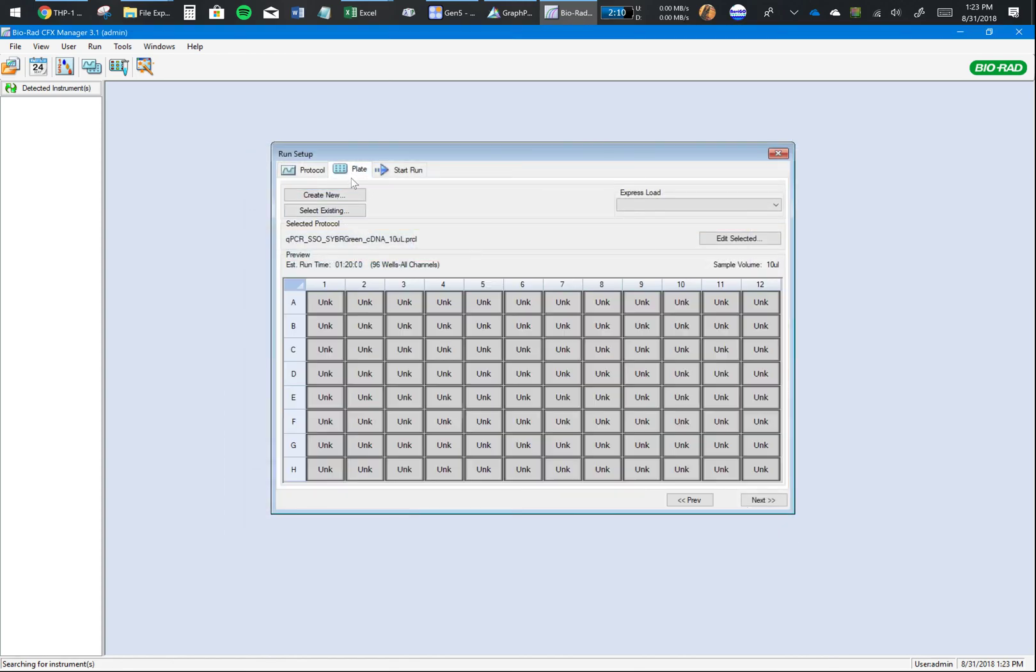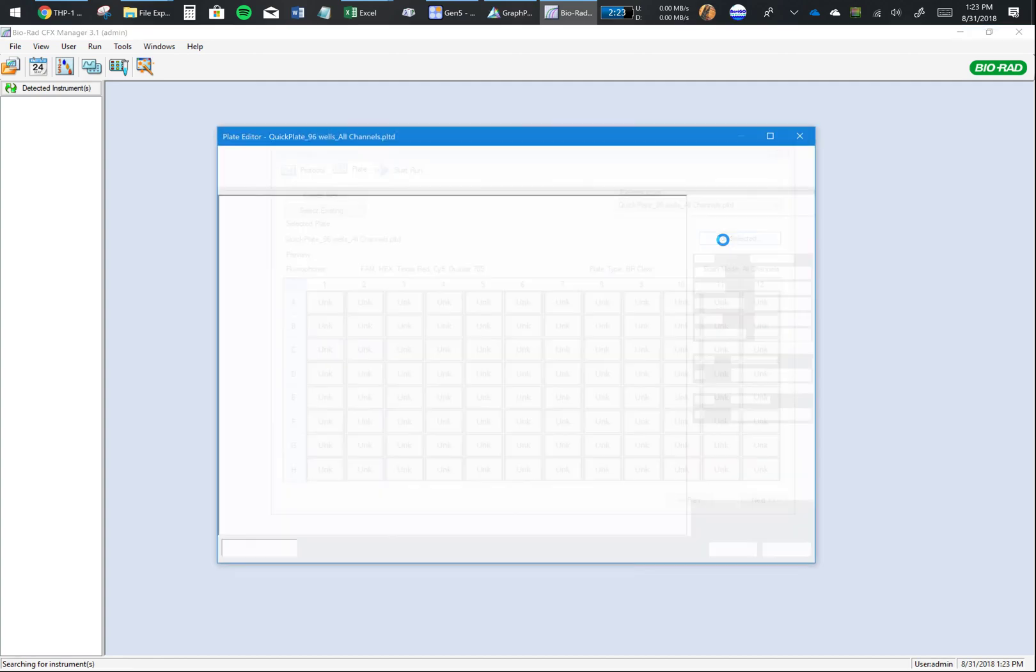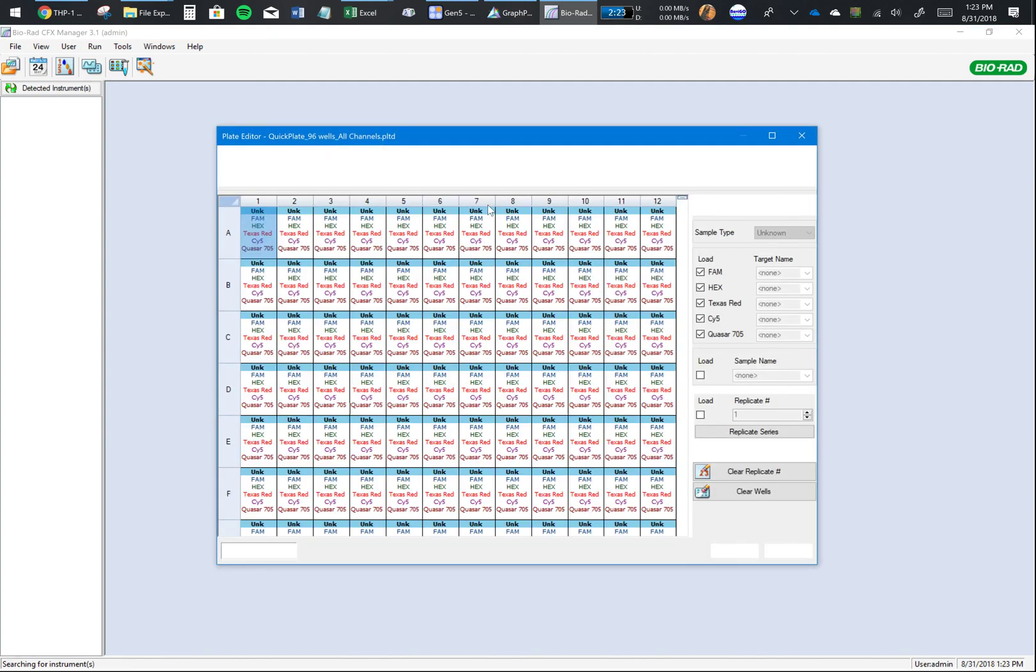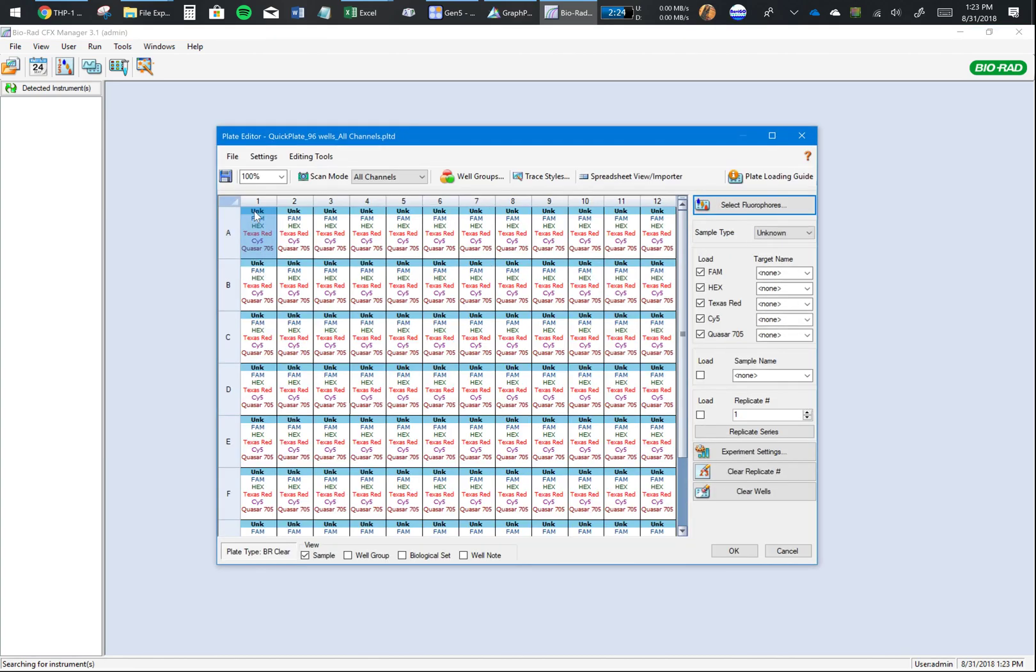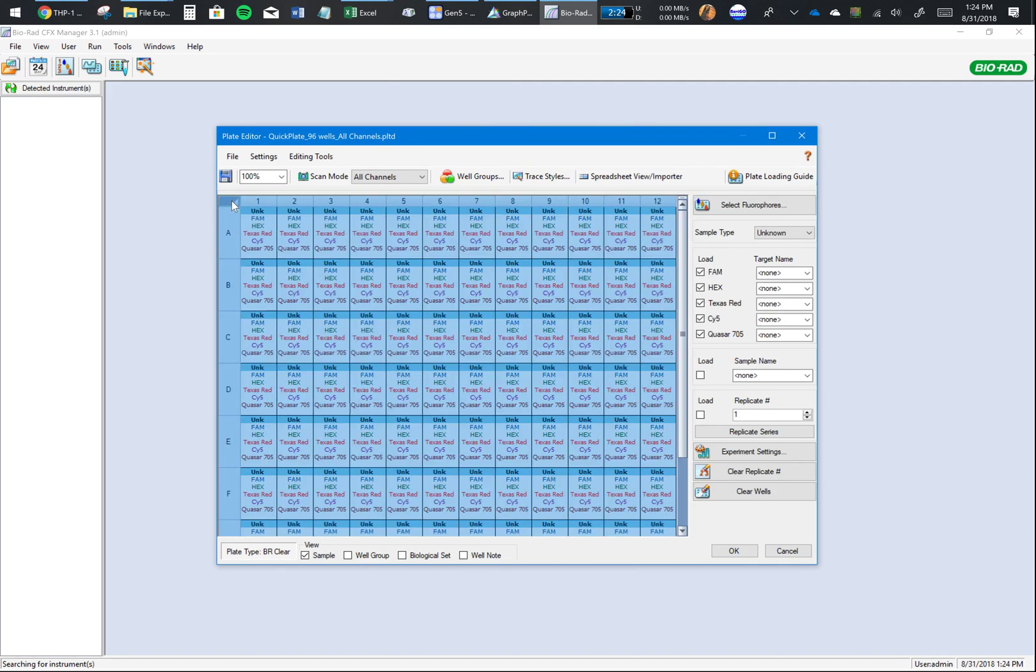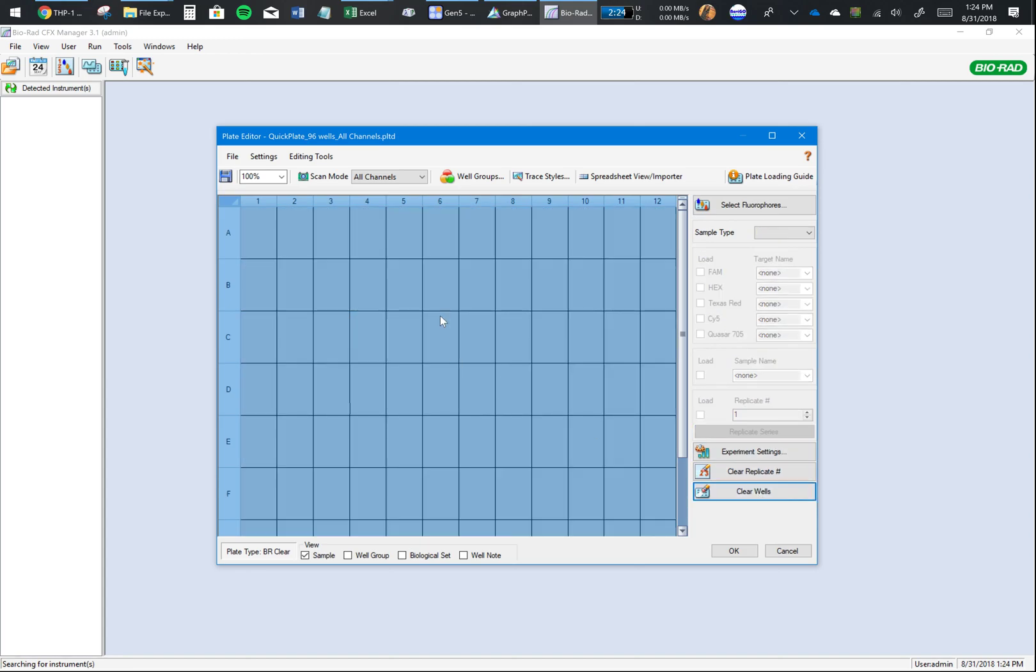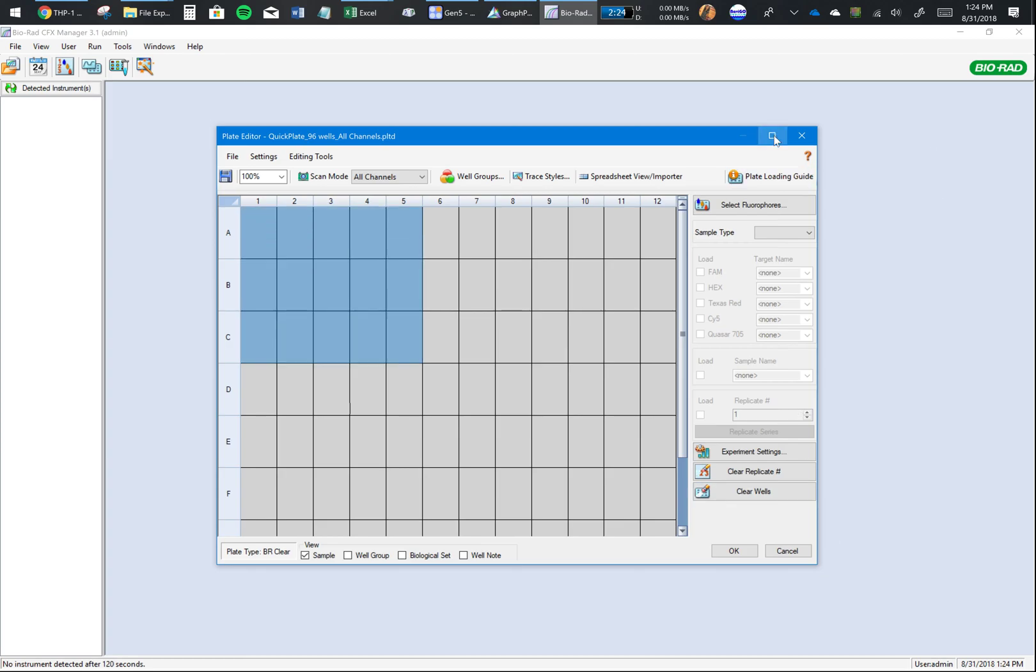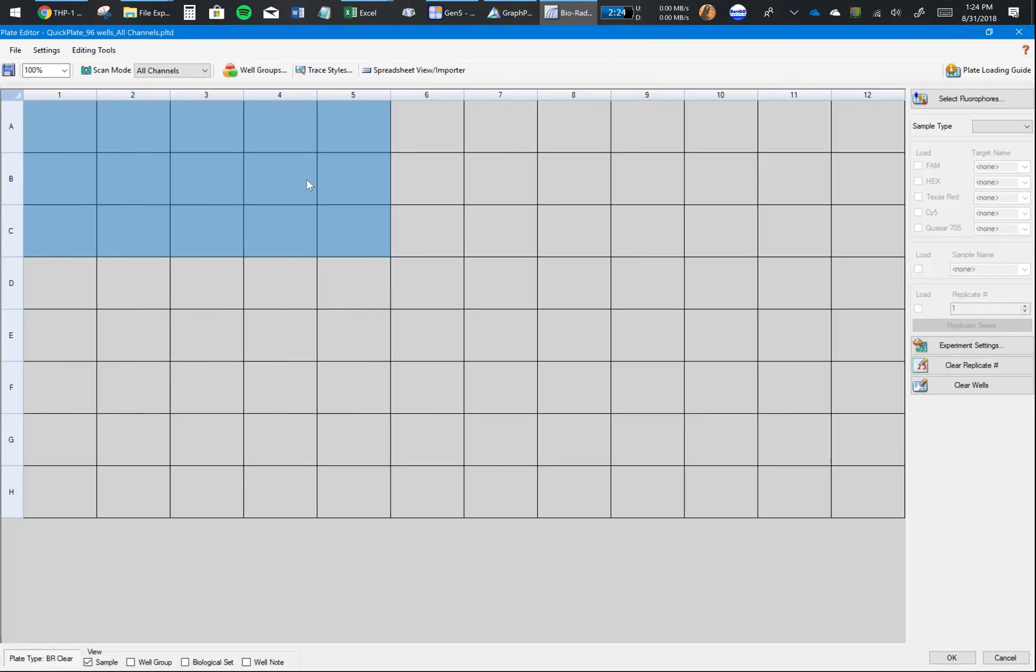Now go to the Plate tab. Here you're going to explain to the software how you set up your plate. Click on Edit Selected. First thing you want to do is select everything by clicking here and Clear Wells.